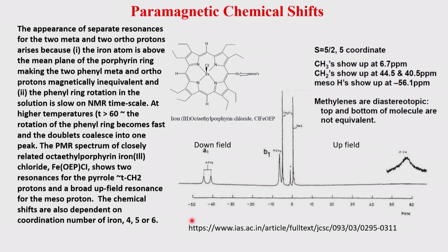This is put as a reverse field. These are the positive side, this is actually the negative side, using a certain kind of criteria. But anyhow, you can see beyond 40, 50, and this side also beyond 50, 60, and very broad. See, this is the actual signal. When you raise the scale, you will see that there is more.